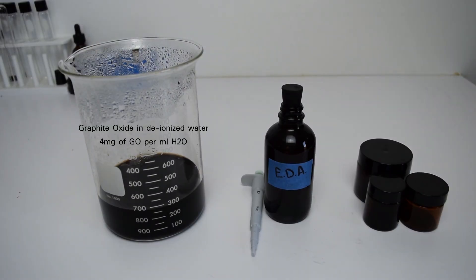Hello, for this video you'll need graphite oxide in deionized water at a mixture of four milligrams of graphite oxide per milliliter of water. Next you'll need ethylene diamine as a weak reducing agent, which you'll use at 20 microliters for every five milliliters of graphene oxide solution.